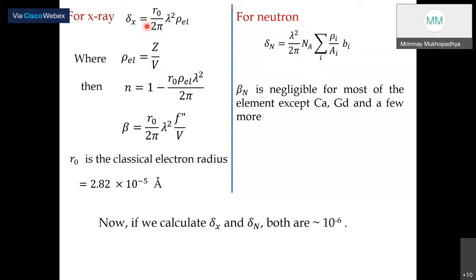This doesn't depend on the material density, but really on the Z values, that is the electron density, not the material density. The higher atomic number elements will have higher electron density, and then we can have higher delta. So the material will be much rarer, that means denser and rarer, for X-ray.